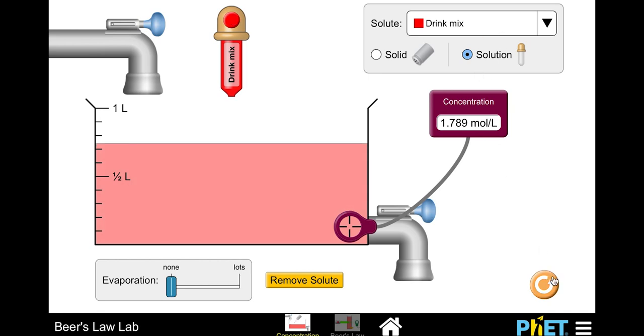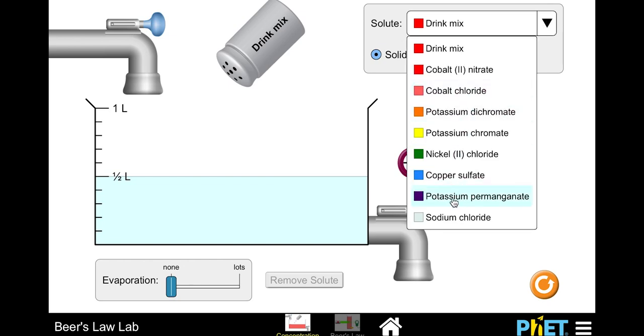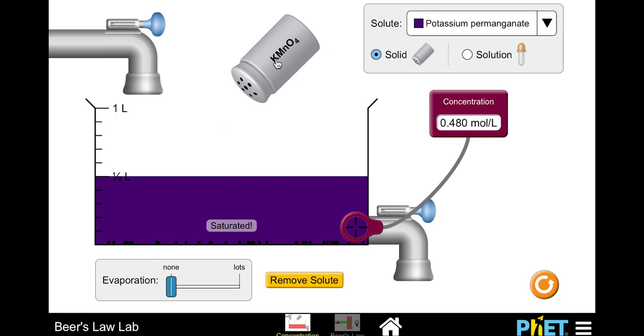This also works well for other substances, chemicals such as potassium permanganate. As the concentration of potassium permanganate increases, the color intensity of the solution increases. So sometimes it's easier to label a colored drink dilute or more concentrated just by looking at its color intensity. Now we are going to use the same principle in spectrophotometry or colorimetry.